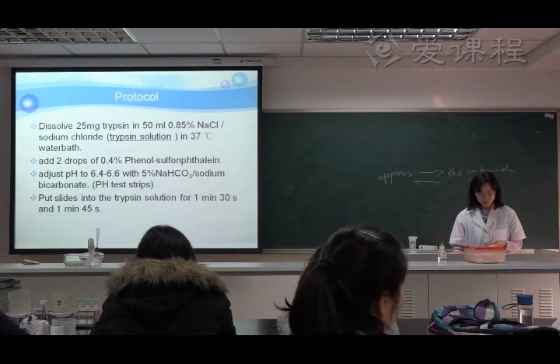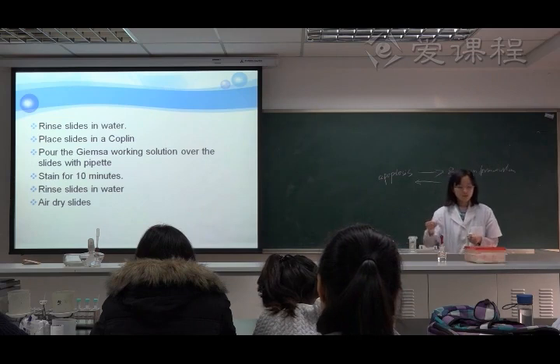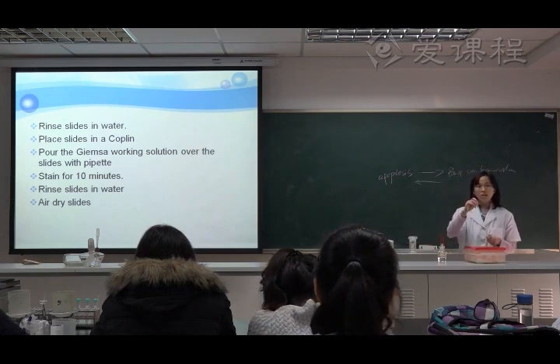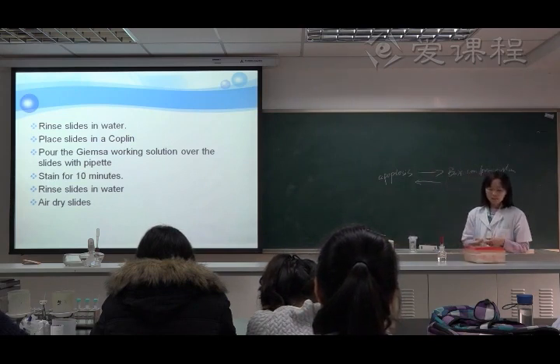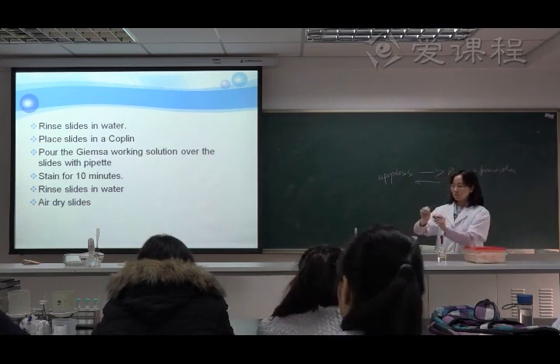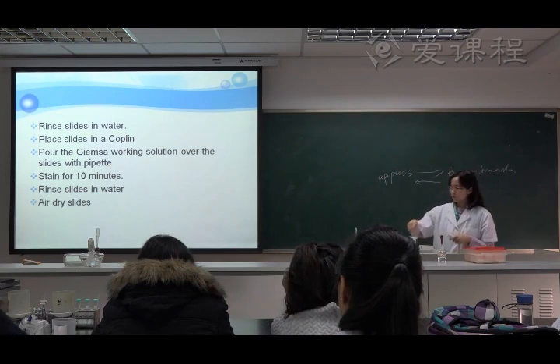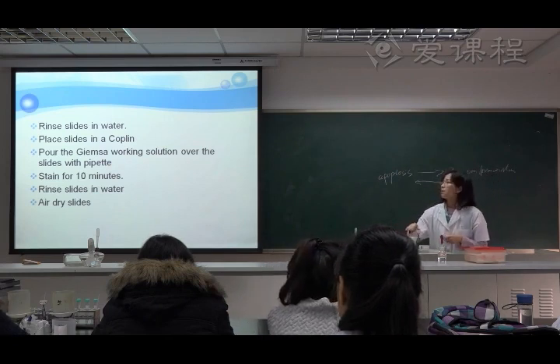After this, we rinse the slides in water. You can use the sink at the rear of our classroom. Place the slides in a coplin jar like this, and pour the Giemsa working solution over the slides, just covering them.